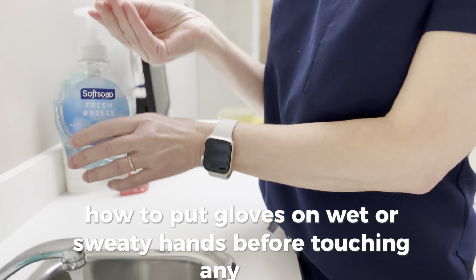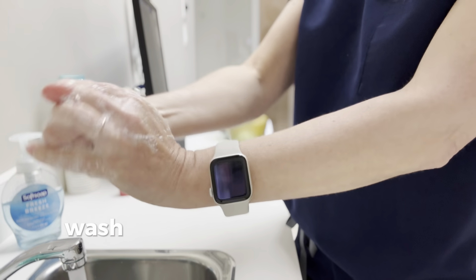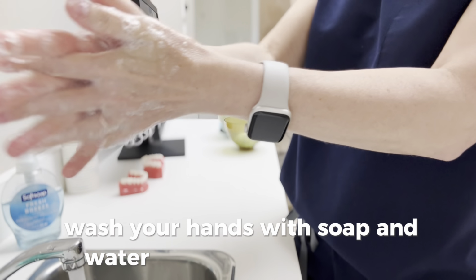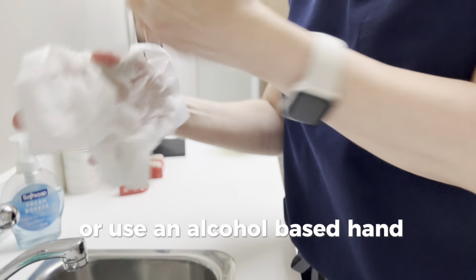Before touching any PPE, start with proper hand hygiene. Wash your hands with soap and water for at least 20 seconds, or use an alcohol-based hand sanitizer.